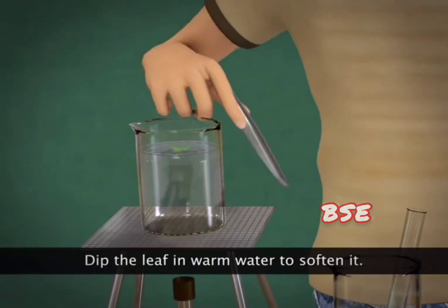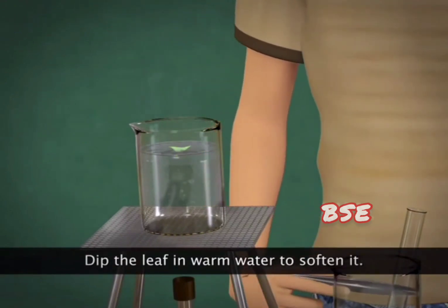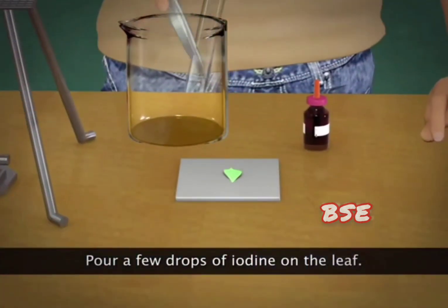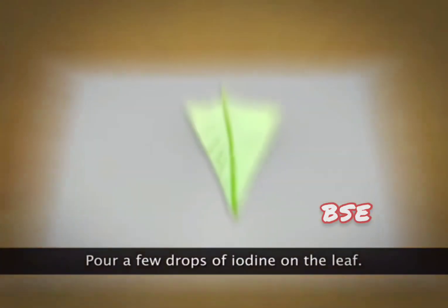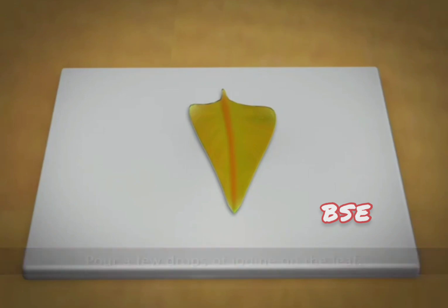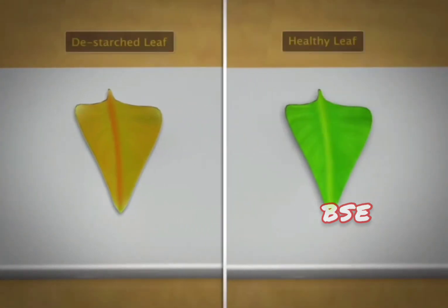Soften the leaf by dipping it in warm water. Now, place the leaf on a plain surface and pour a few drops of iodine solution on it. Carry out the same procedure on a leaf plucked from a plant kept in sunlight. Then subject it to iodine solution.